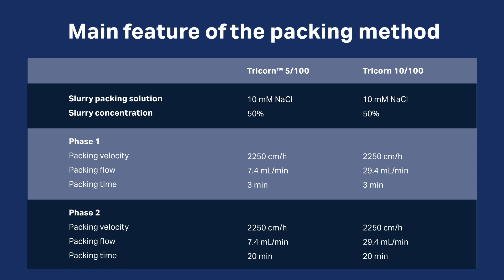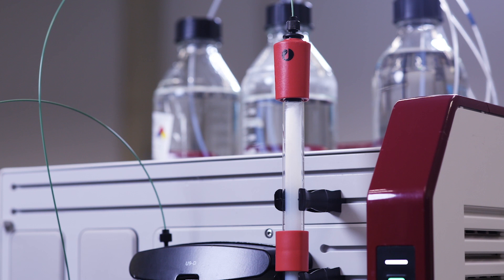If you work at lower temperature, reduce the flow accordingly to avoid high back pressure caused by high viscosity. After the indicated packing time for the specific resin, stop the pump. Place the stop plug at the bottom of the column.